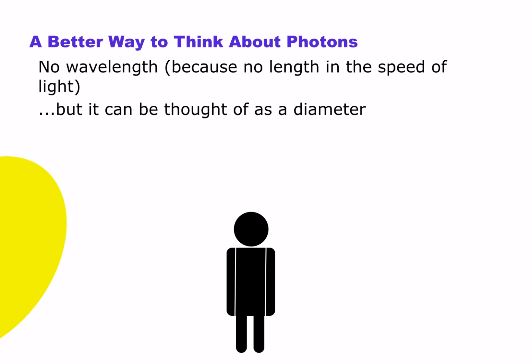Let's say you listen to the radio. You know the size of your car antenna? It's about how large the diameter is of the radio photon you're trying to interact with. Your cell phone actually operates with these larger photons as well.